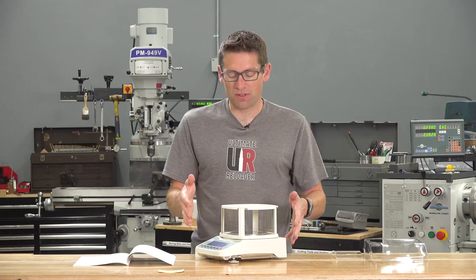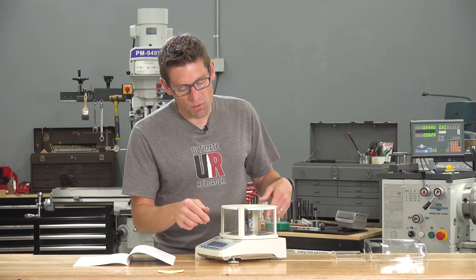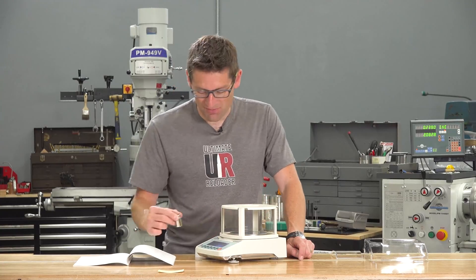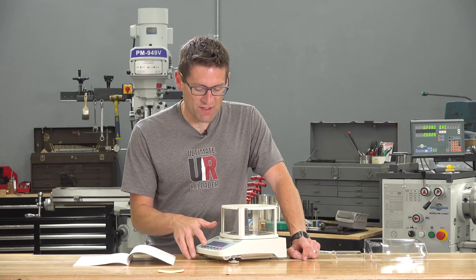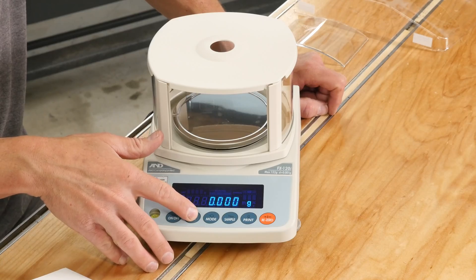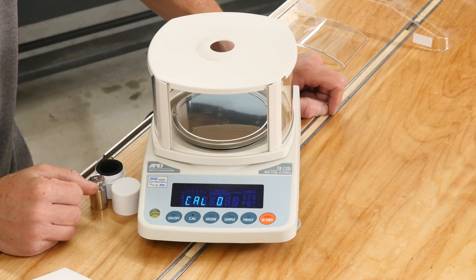Now at this level of precision, you'll notice if you bump the table or if there's any air currents, you'll see that number fluctuate. We're steady here and that's because I did a practice run on the calibration. Let me show you what that process looks like. So if you hold down the Cal button, it's going to indicate Cal out. That's the external calibration indication.